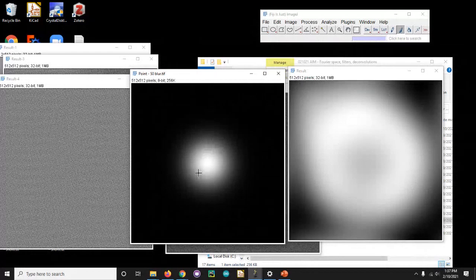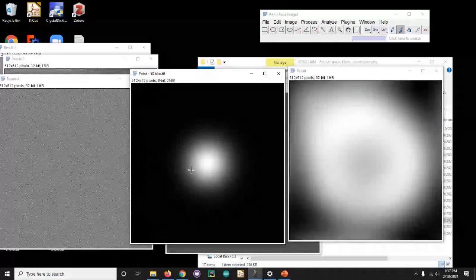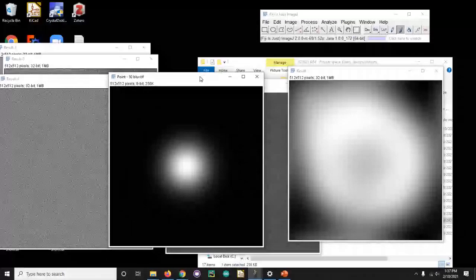You're going to have to measure it with the same optical system that you're using to collect the original image. In other words, the accuracy you can get your point spread function is bounded by the same accuracy you're using to get the original image. So that's the third factor that's kind of running against us: there's a limit to how accurately we can know the point spread function.